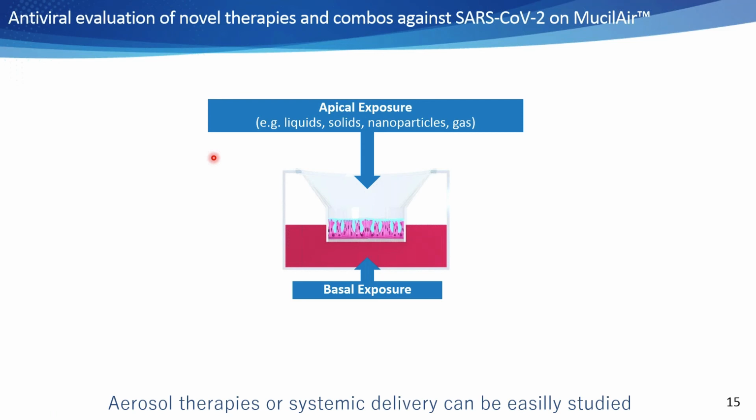So first, this type of model, being tight, being at an air-liquid interface, is used to test different application modes, meaning that we could test systemic deliveries of a novel therapy, adding the compounds, therapies or the combo in the basolateral medium, but we could also test aerosol therapies directly on top of the airway epithelium, such as liquids, solids, nanoparticles, gases, or using a nebulizer for example.